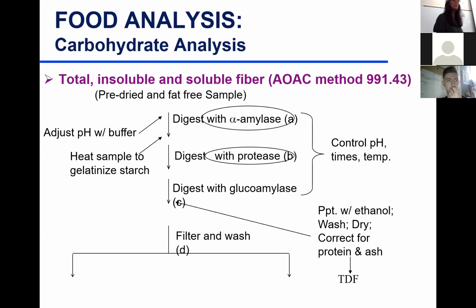So why is it nobody likes it? Because it's very involved and lengthy. What you do is you get your sample that is hopefully dry. If it's not a dry sample, you pre-dry it. If it has a high fat content, you defat it. If fat content is 2% or less, that's fine, you continue with it.